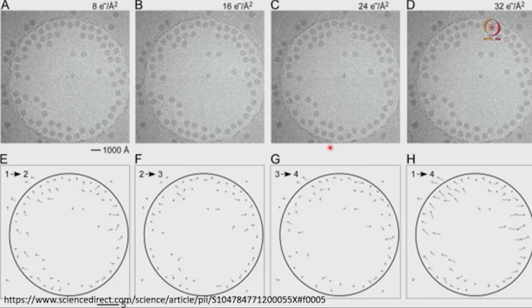Now, we discuss this particular event: when an electron beam is going through that sample or amorphous ice, there will be some changes, right. So, first let me explain what is happening here. This is the hole we are talking about, that cryo hole we are constantly talking about, and this is the carbon area where we want to focus, and those are the amorphous ice inside that hole, and those are the individual virus particles.